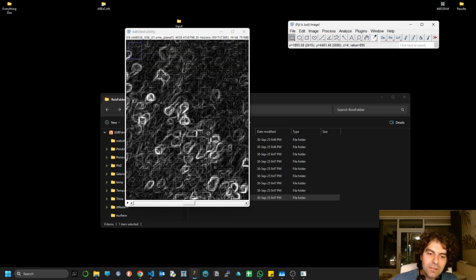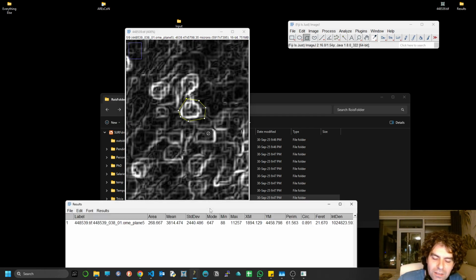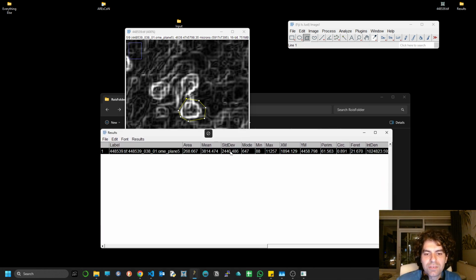You see that now it has converted the image, and now if we have a ROI, and assuming that the ROI is this one, and we take a measurement of that ROI, then we can take its standard deviation, and the bigger the contrast is between the contours and the inner information of pixel values, it probably means that the more crisp in reality the neuron is, because what makes something crisp is actually its difference from the background, right?